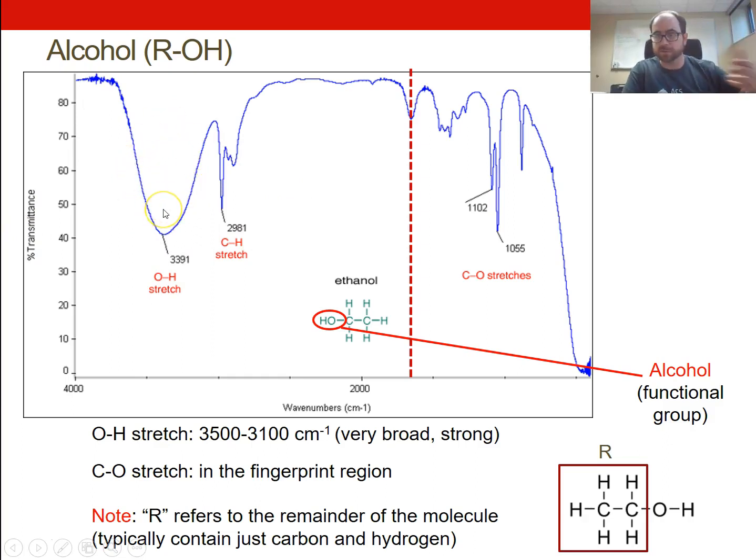It's kind of the largest peak that we see just looking at the IR spectrum. This corresponds to the stretch of the bond between oxygen and hydrogen. And notice in the hydrogen region, we also have, again, CH stretches, and these correspond to sp3 hybridized CH stretches. Again, they're below 3,000, and that is consistent with these two sp3 hybridized carbons.